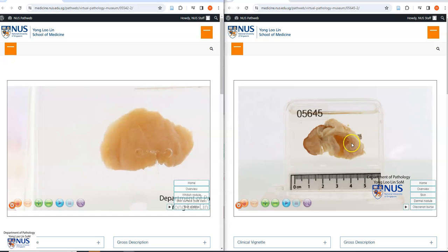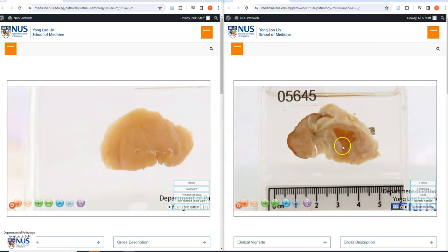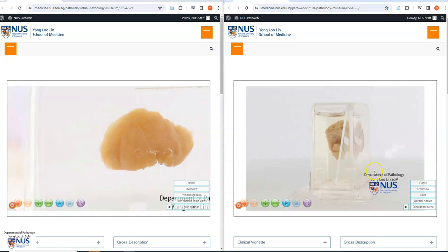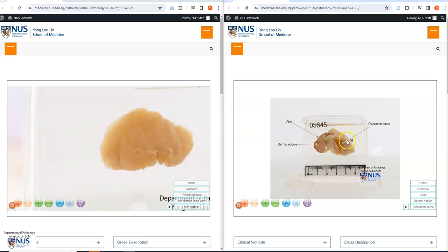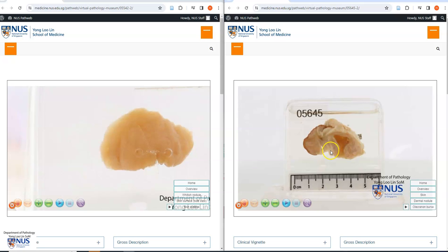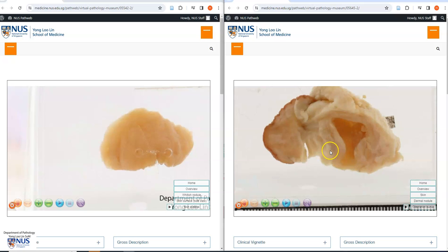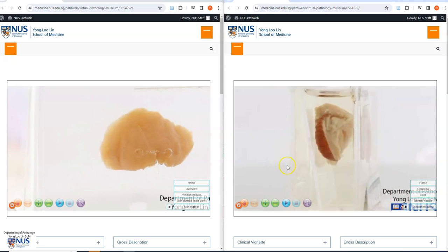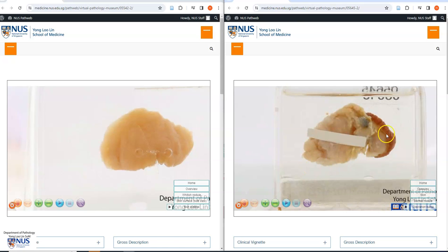This is another example on the right, and this is very closely related to the olecranon bursa in the elbow. Here is the skin overlying this keloid, which is in the form of a nodule. We can see the whitish cut surface and the intact skin overlying this.